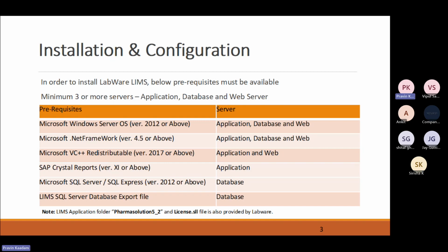Besides this, some organizations, I've heard, are using even MySQL, and I have also seen people using MongoDB for LabWare LIMS, but it is not published in any of the LabWare white papers.